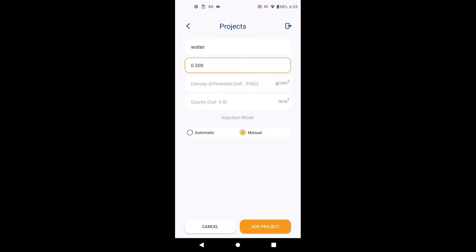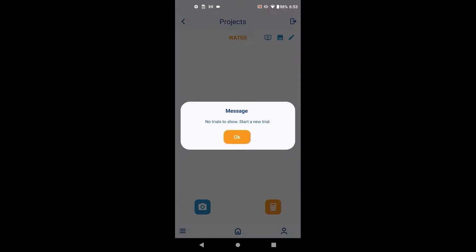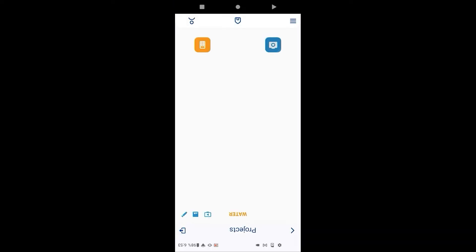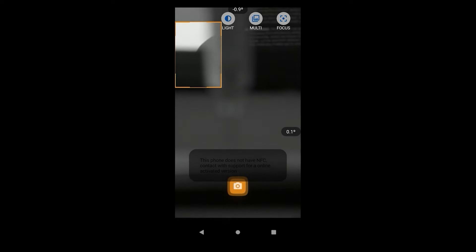If you wish to provide a more precise gravity value, you can. Select the injection mode depending on if you ordered the automatic dispenser hardware add-on. Click on the newly created project and enter the image capture screen. We now put the phone inside the phone holder, click on the blue image capture button, and adjust the distance from the needle.